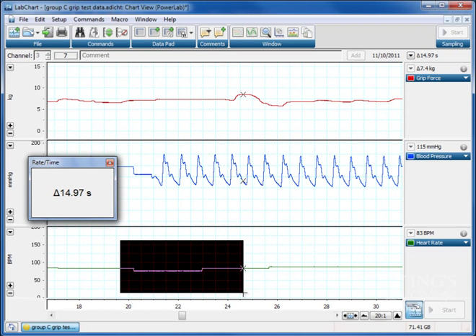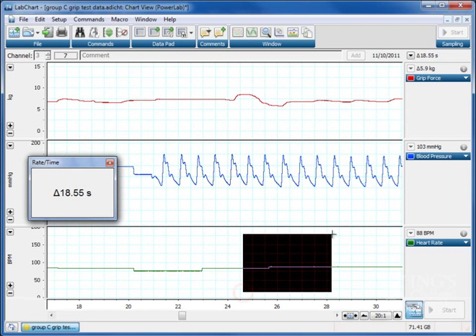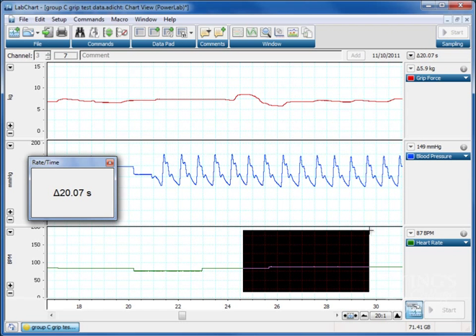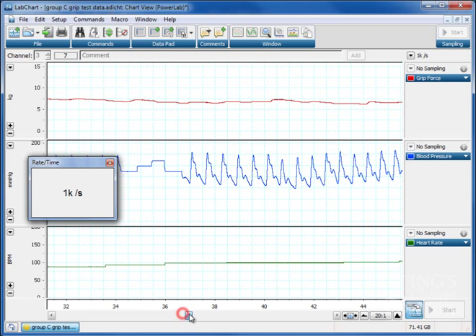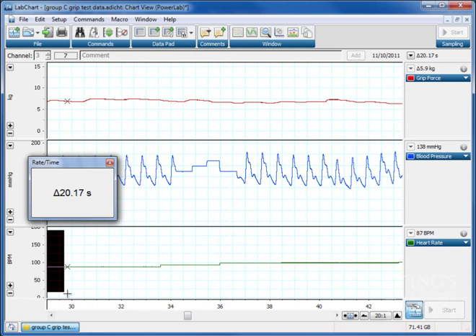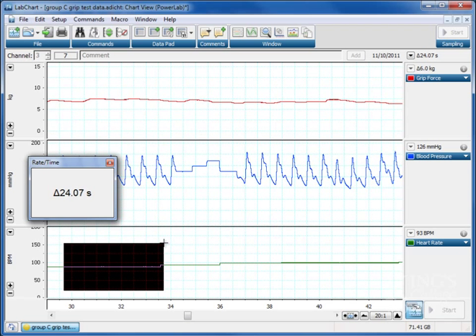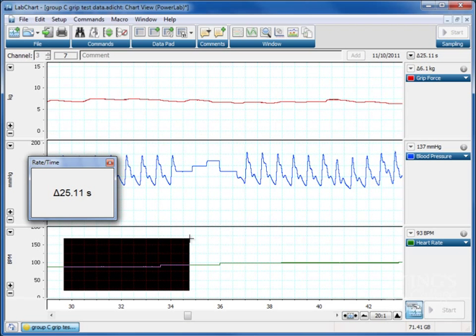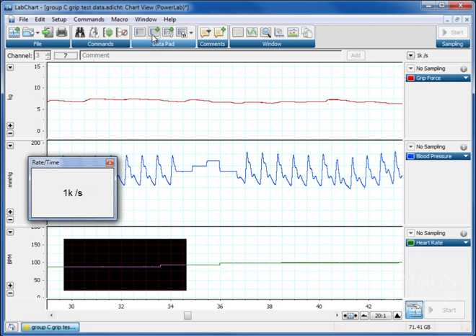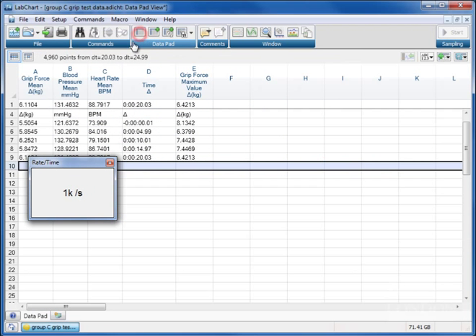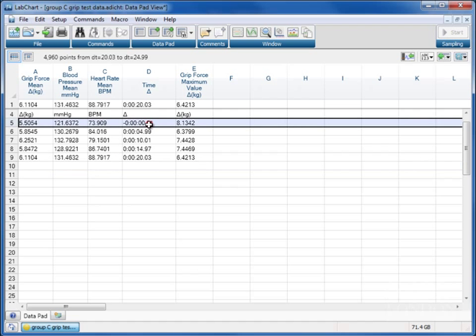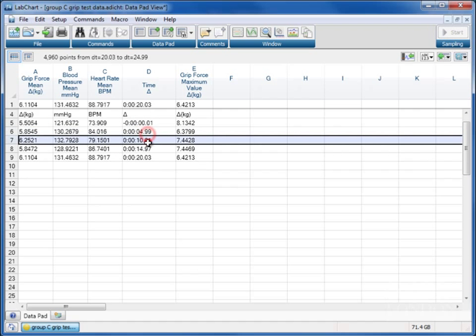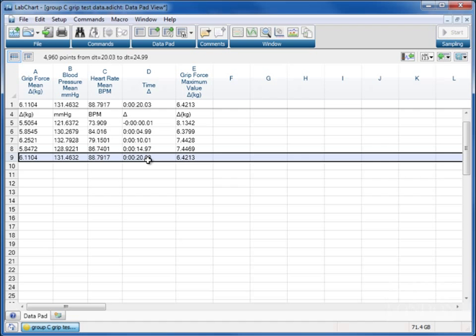And then we'll choose from 15 through to 20. Add that to our data pad. And you can see we can do this for the rest of the data file. I'm not going to spend the next five minutes here clicking on it. But here we've got up to and including 25 seconds. Go to our data pad and we've now got a series of data. 0, 5, 10, 15, and 20 to 25 seconds in five second bins.